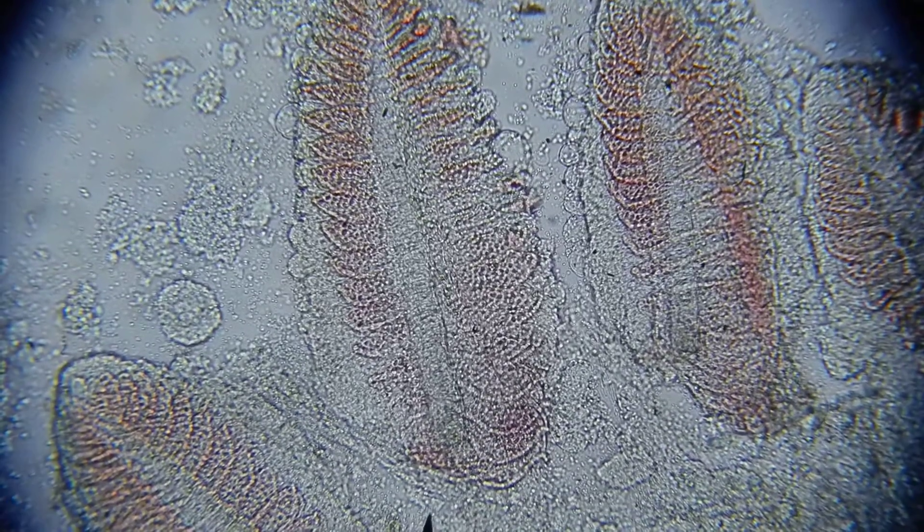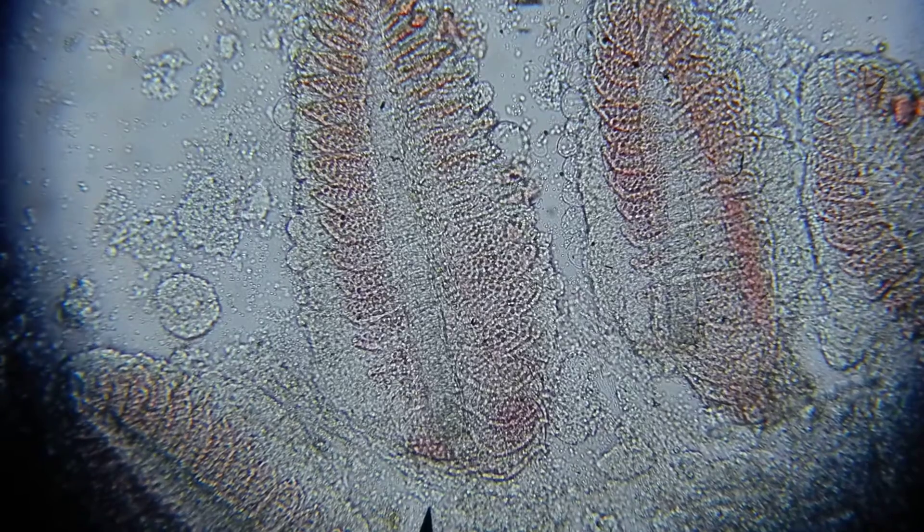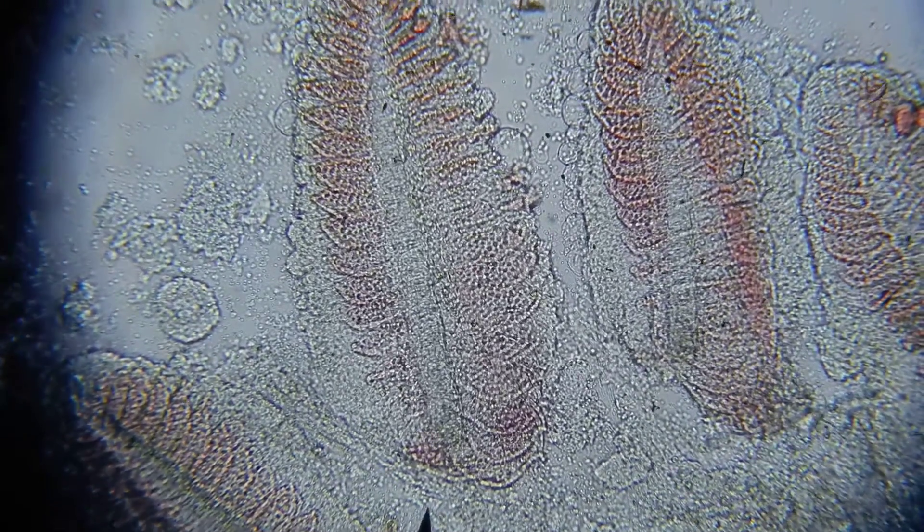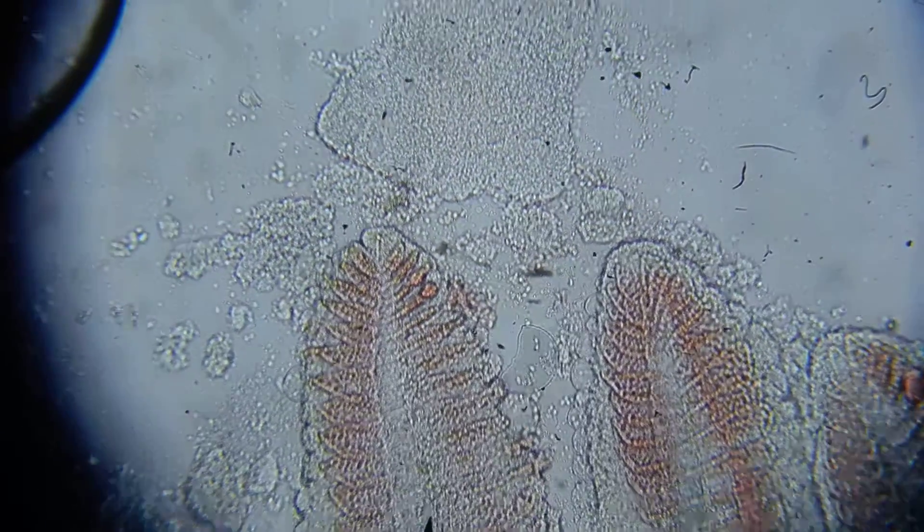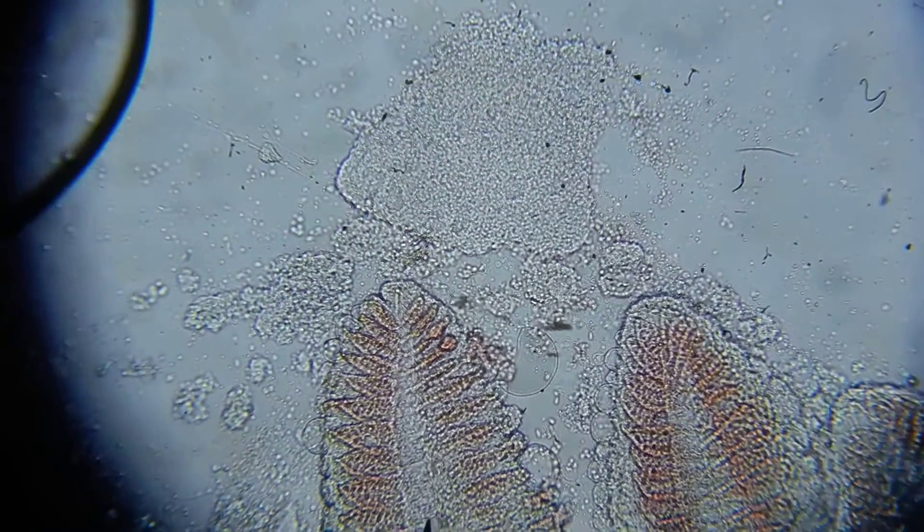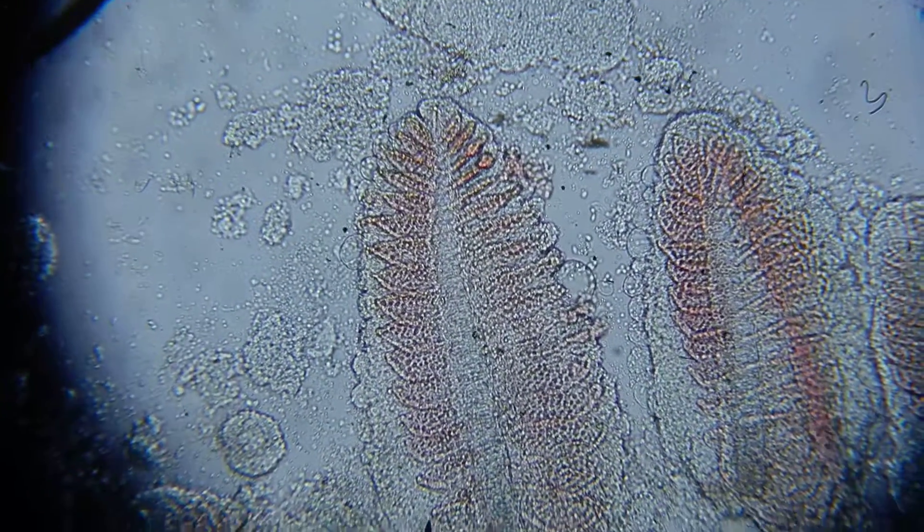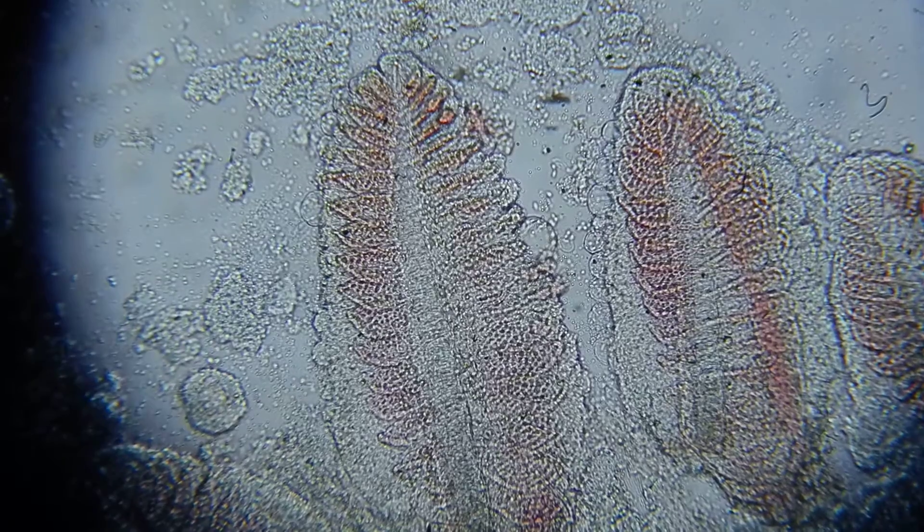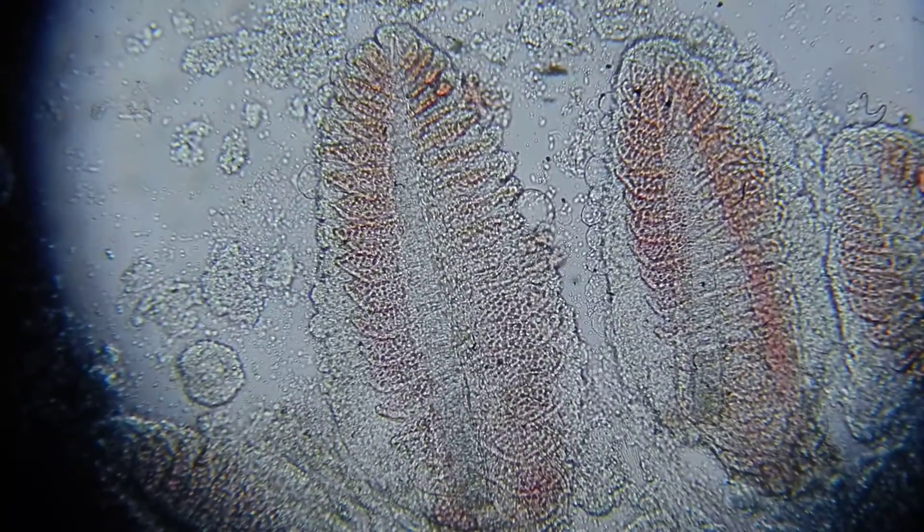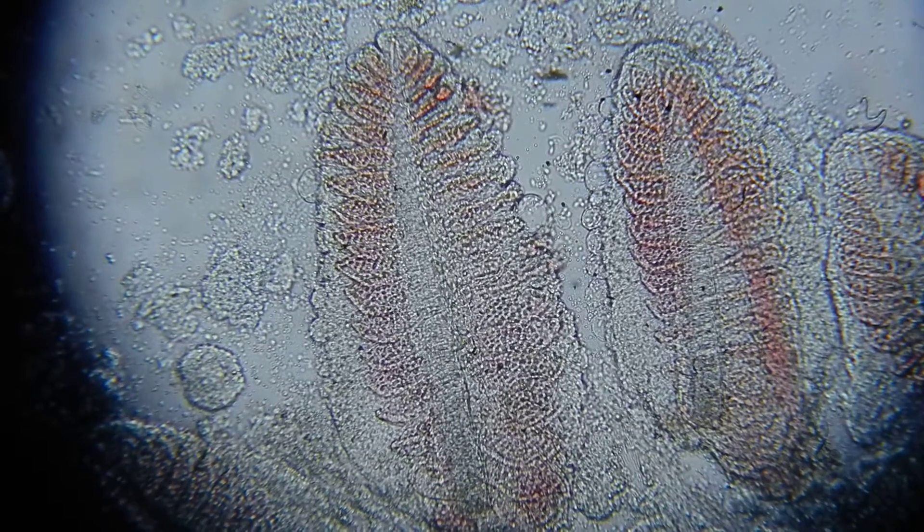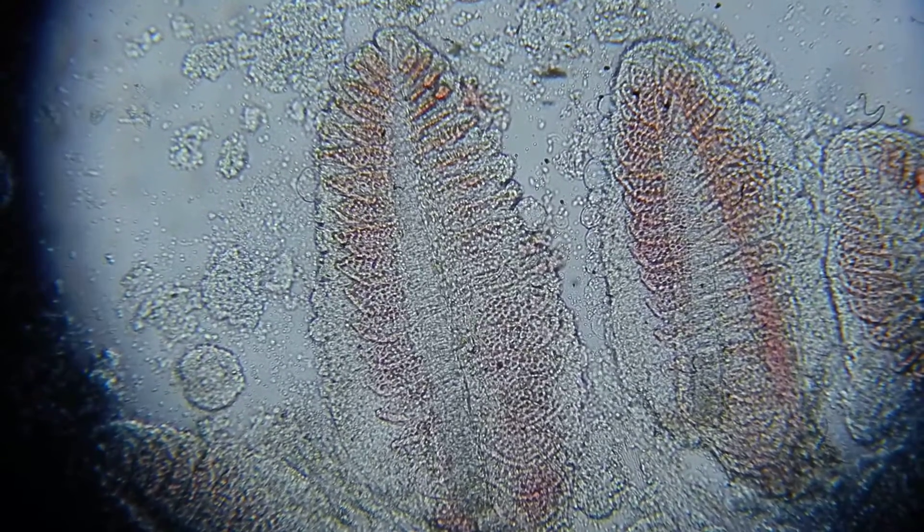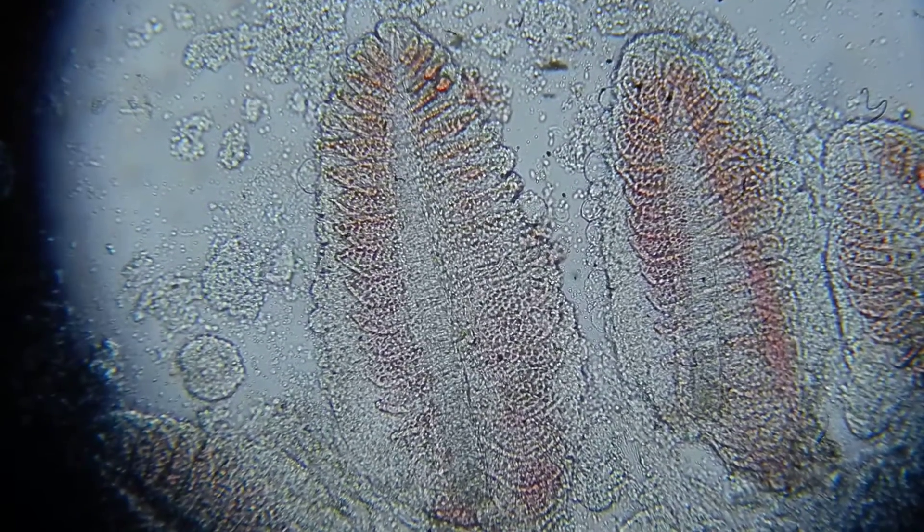So I've got a little pointy bit of an arrow at the bottom of the screen so we'll use that to point to you what's happening. So running through the center is the cartilage of the primary filament, and that holds it all up. And going across to the left and to the right are called secondary lamellae. And these are sort of flat leaf-like structures, sort of like the leaves of a book. And it operates like an inside-out lung in a counter-current fashion.